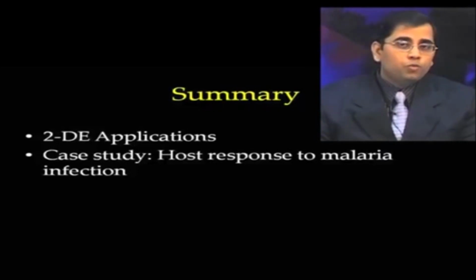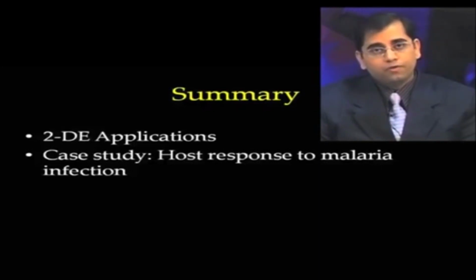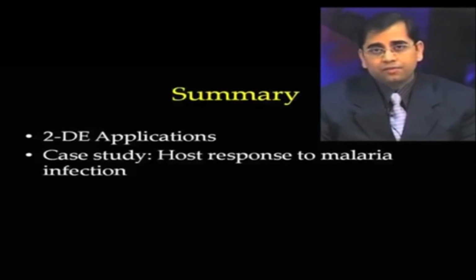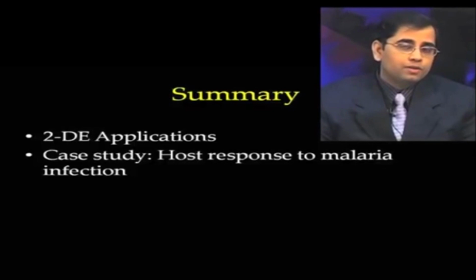So, today we discussed not only one application, how host serum proteins change due to one of the Plasmodium parasites, but also the various nitty-gritty experiments one needs to perform to achieve such a comparison. We will continue our discussion on some more applications of two-dimensional electrophoresis and also two-dimensional difference gel electrophoresis, because due to the variations in 2DE, people also try 2D DIGE experiments, which are very sensitive. That also expands the overall proteome coverage. So, we will continue our discussion in the next class. Thank you.